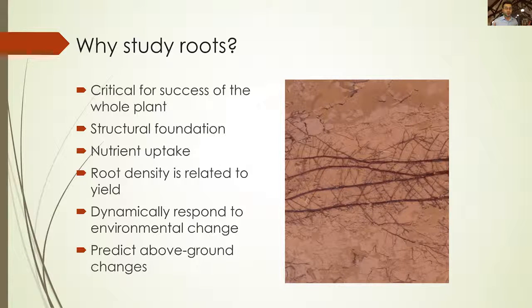But first, let's cover why we should study the roots. One, it's critical to the success of the whole plant. They are absolutely critical for understanding plant or crop yield, environmental effects, and the additions of certain chemicals and elements. Greater emphasis has been placed on root study, so that instruments such as the Minirhizotron are no longer simply in the domain of scientists, but are also being utilized by crop consultants, agricultural researchers, and farmers to understand the effectiveness of soil treatment, fertilizers, and other nutrient applications. They can be used for, say, measuring and planning for the impact of drought and temperature fluctuations, or monitoring for root pathogens and estimating crop yield. So root study is really an integral portion of the understanding of the plant's health and production as a whole.